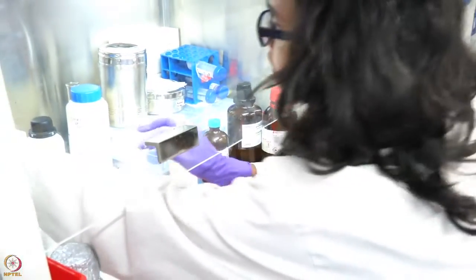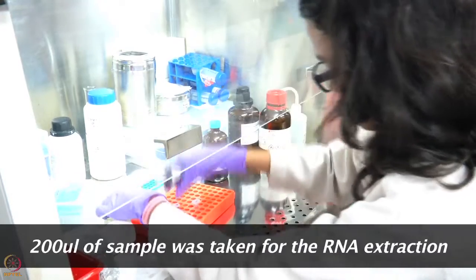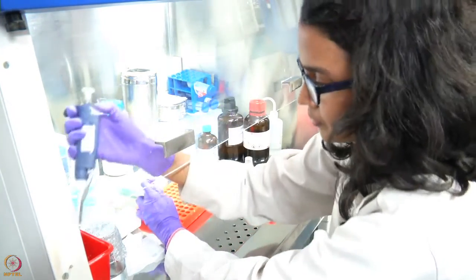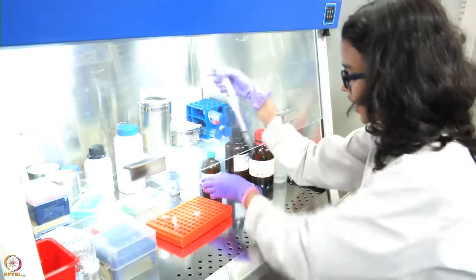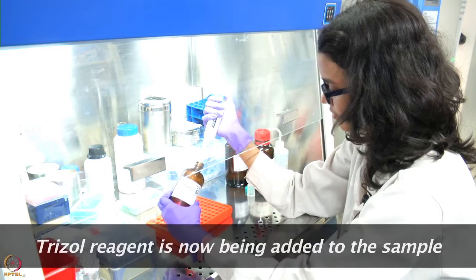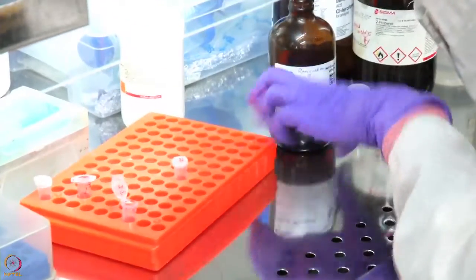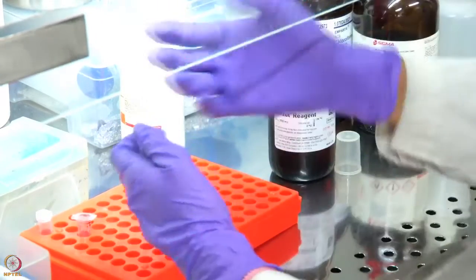We will be taking around 200 microlitres of whole blood. After adding the blood, we will then be adding the Trizol reagent. The Trizol reagent basically contains phenol and guanidine thiocyanate, which will help to lyse the cells and bring the cellular contents into the solution.